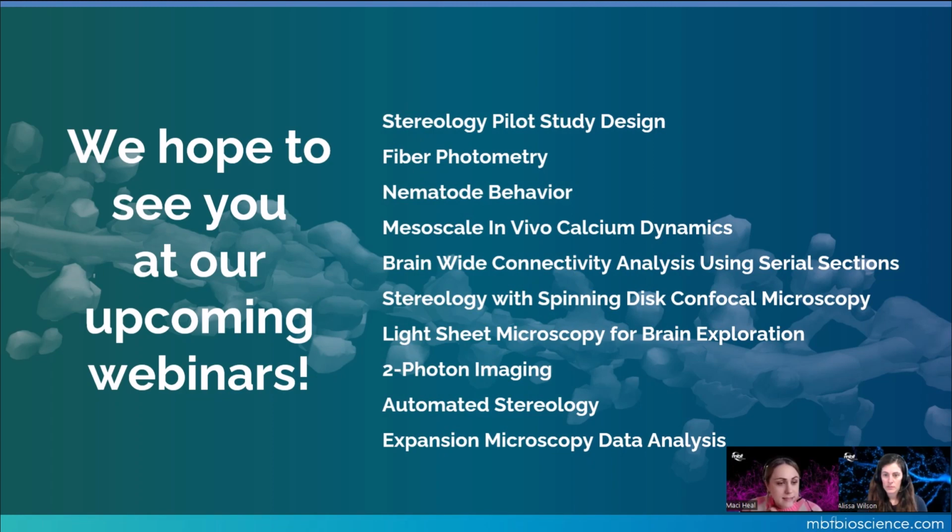And like Alissa and I were discussing earlier in the webinar, there are some filters to help prepare your image data for the reconstruction. And so depending on your data, it might be helpful to run those through either the vessel and or the closing filter to solidify those larger vessels.